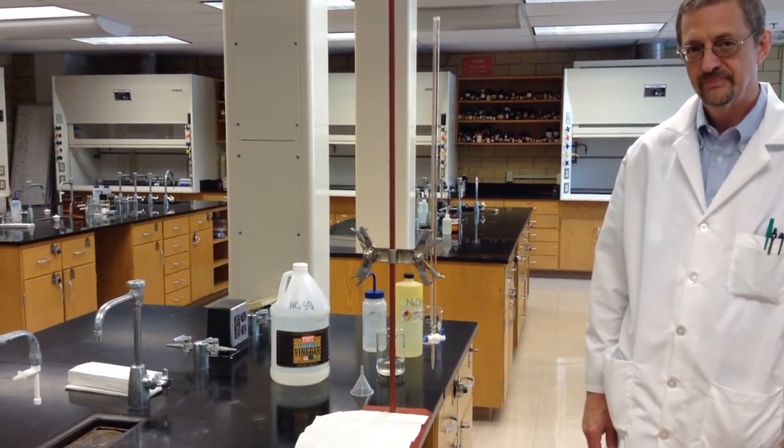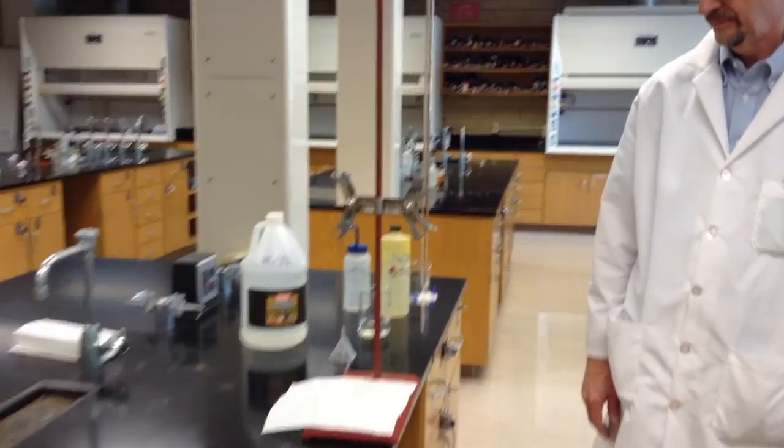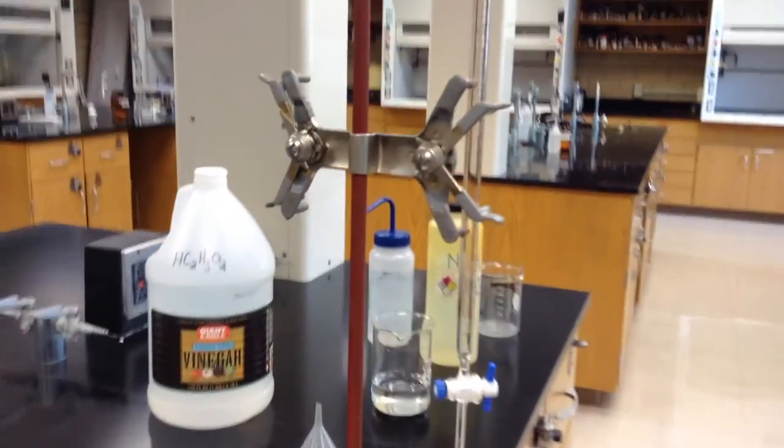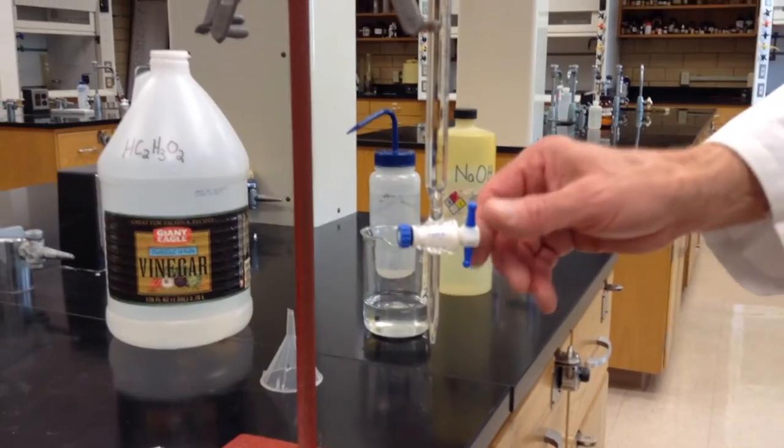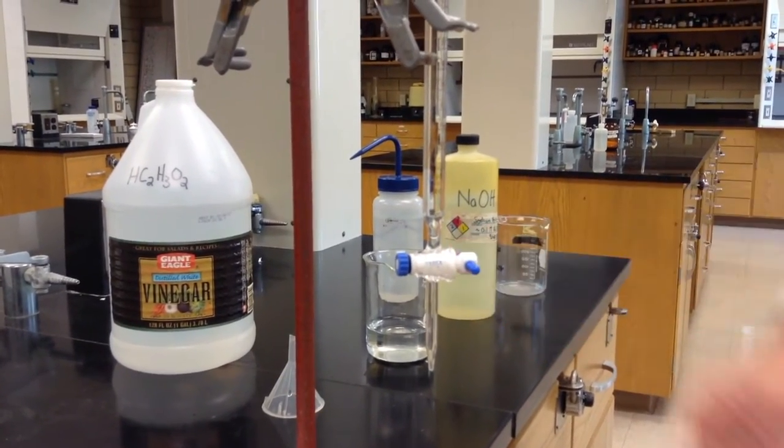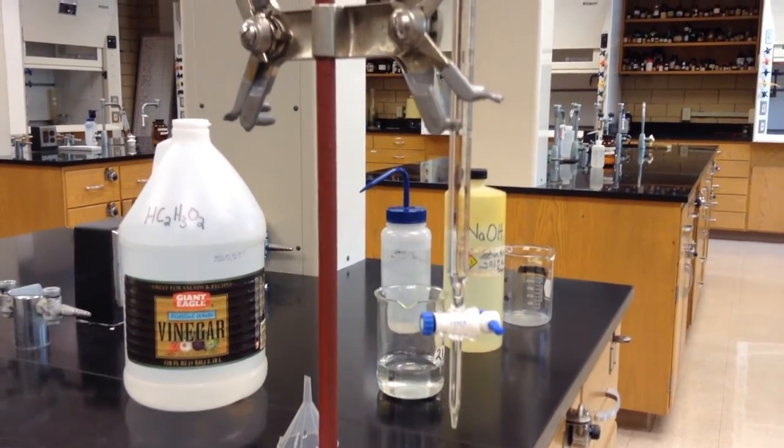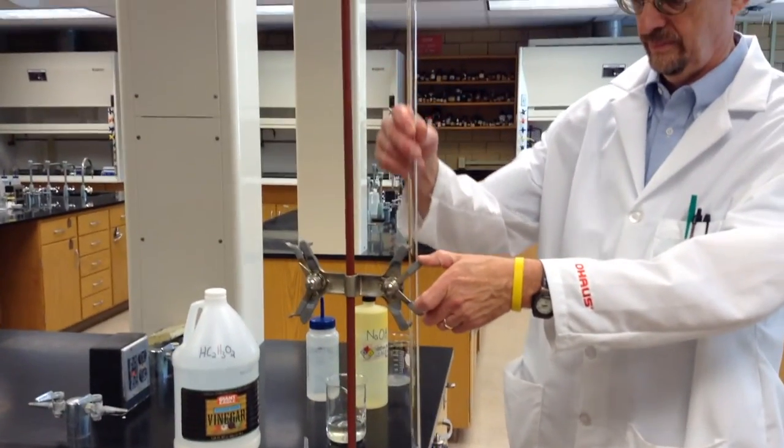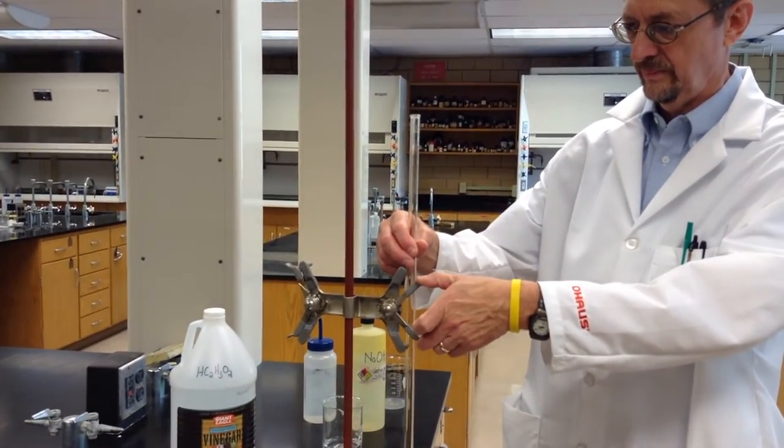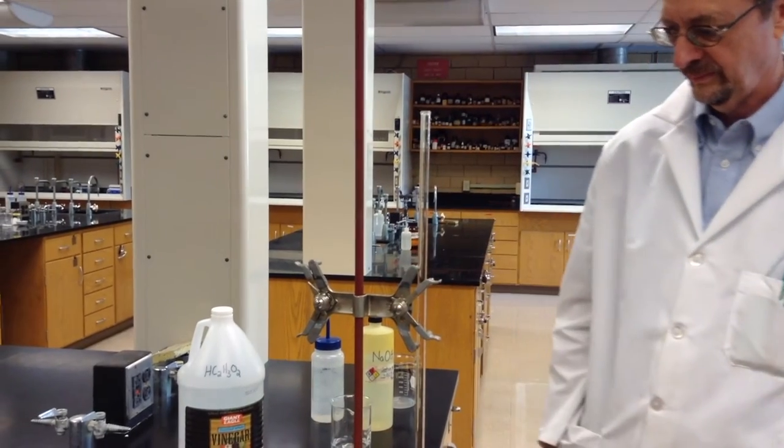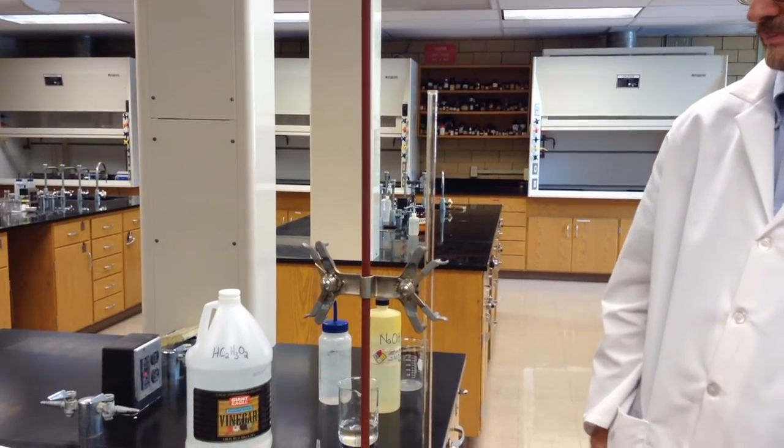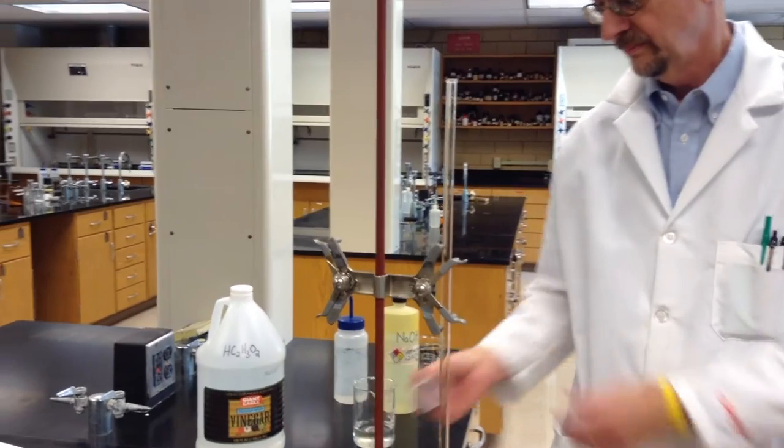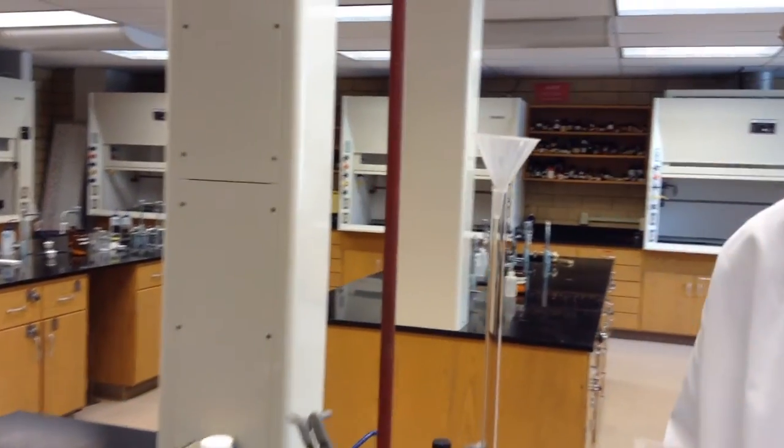The first thing that we want to do is rinse the burette to make sure it is clean. To do this, we first want to close the stopcock. We do that by turning the handle until it is parallel to the ground. Next, to add our rinse agent, we want to move the burette down in its clamp below eye level. Also, to be safe, we want to make sure that we use a funnel in the top of the burette so that we prevent spillage.